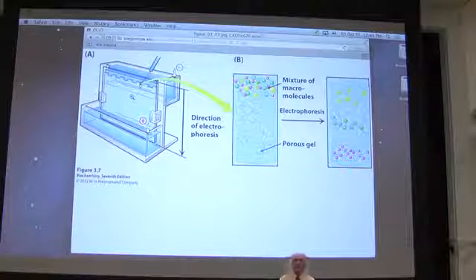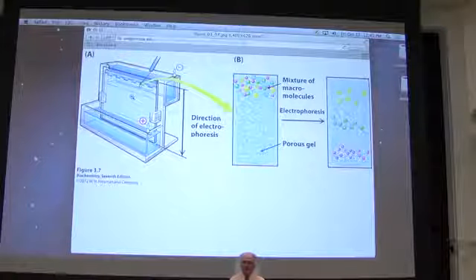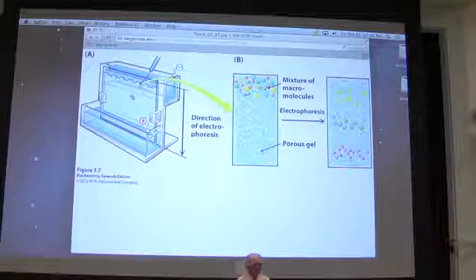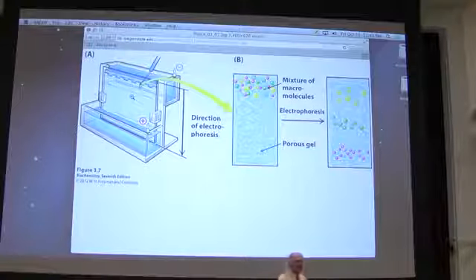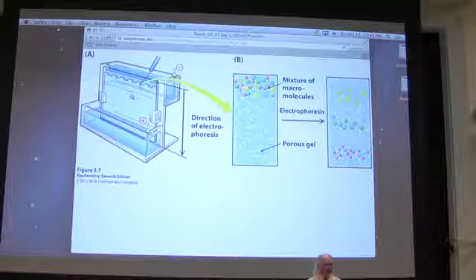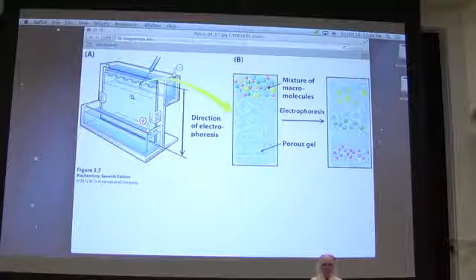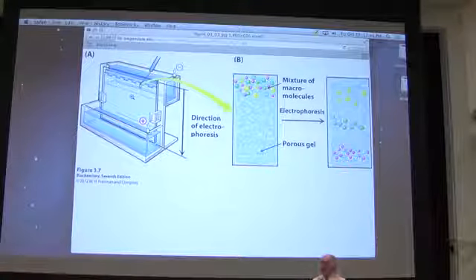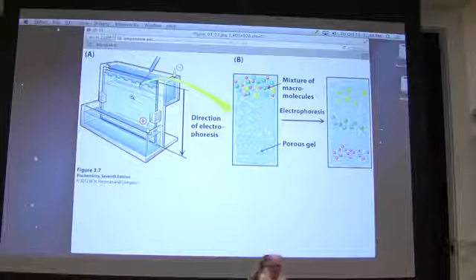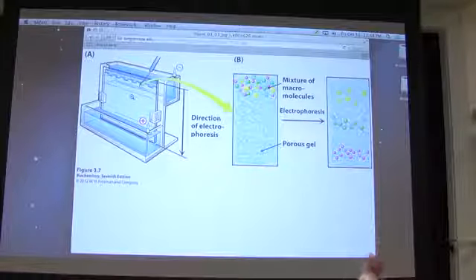Is the SDS readily removable from the proteins at the end of the process? It's a very good question. Yes and no. Do you suppose the proteins at the end of this process would be active? Probably not. So this technique is usually used as an analytical technique. Remember I said we had those little tubes that came down from the gel exclusion? And I said we use other analytical techniques to see what was in them. We would take a little bit from each of those tubes, and we would put it on each well, and we would say which thing is coming out here, which thing is coming out here. So this would tell me very readily which protein is coming out where, because I would see different sizes on that column.